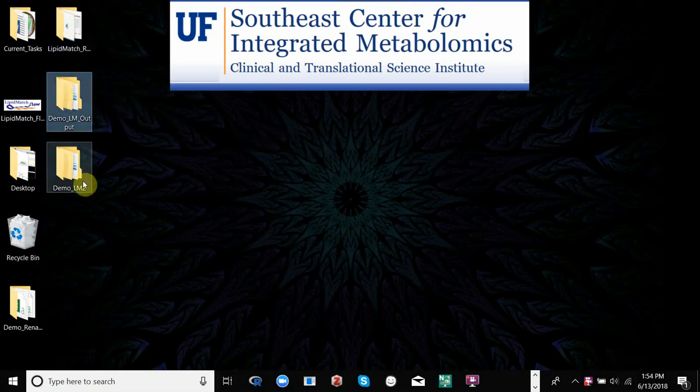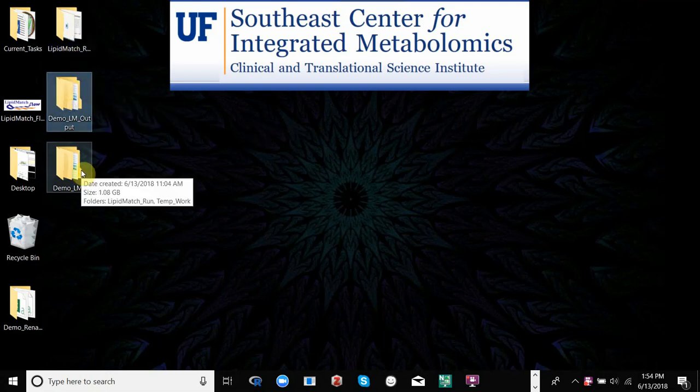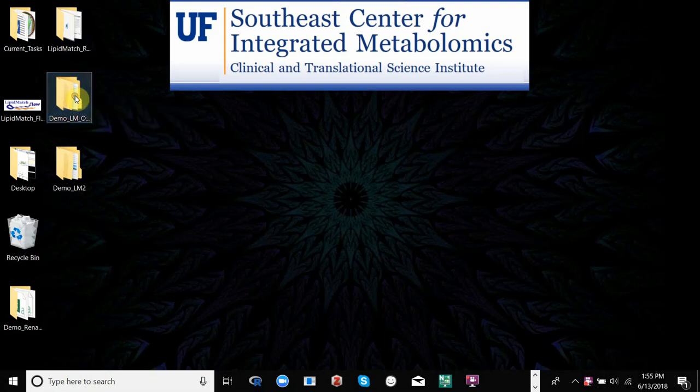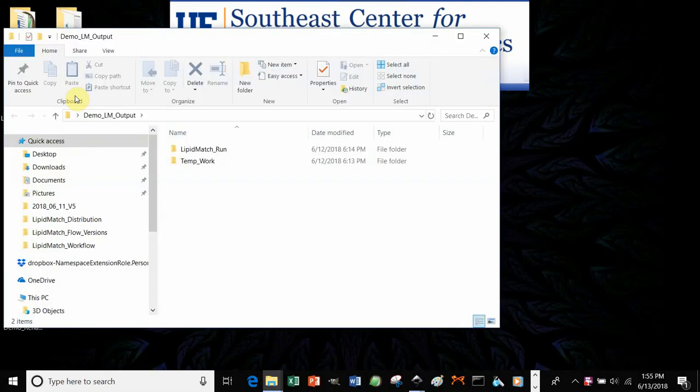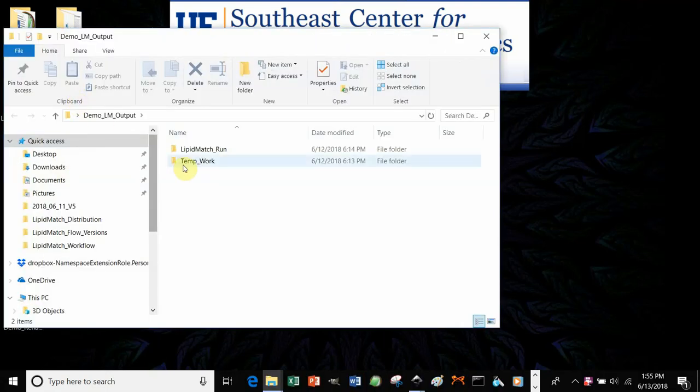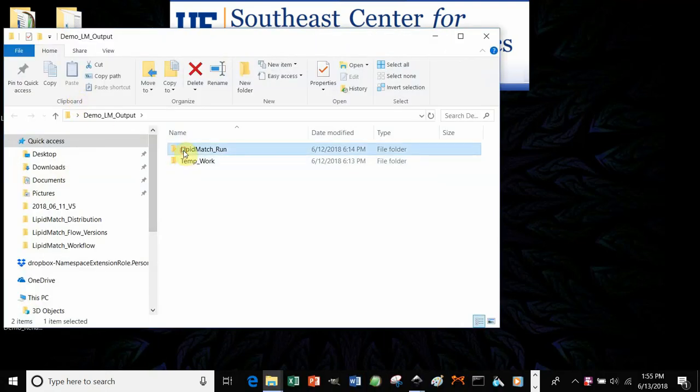So, you should have your output folder. For example, here's the demo we did. And you'll have two folders, TemporaryWork and LipidMatchRun.